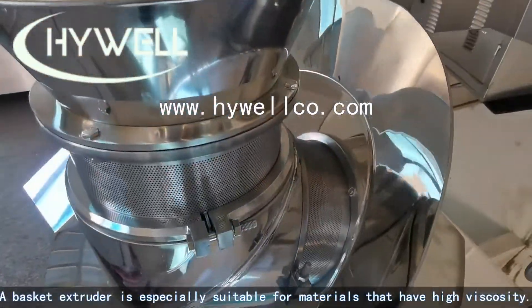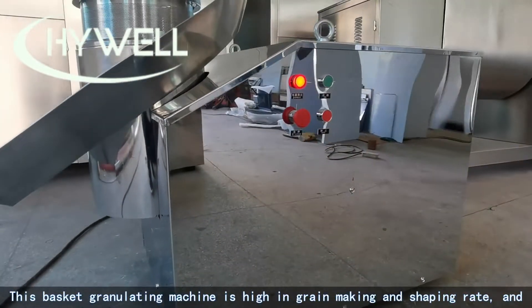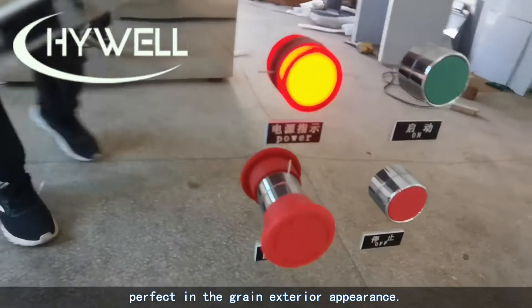The basket extruder is especially suitable for materials that have high viscosity. This basket granulating machine achieves a high grain-making and shaping rate, and produces a perfect exterior appearance in the finished granules.